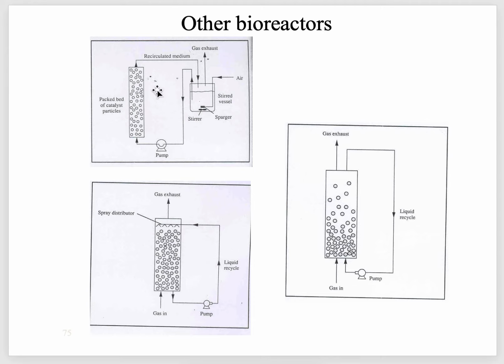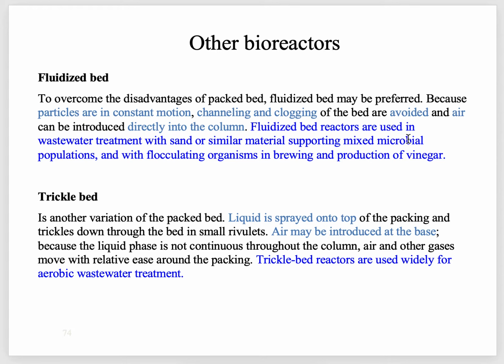Instead, in packed bed, we have to do that in another vessel. In another vessel, we do the introduction of air into the media. Then we transfer or inject that media into the column. But in case of fluidized bed bioreactor, we can directly introduce the air into the column. And fluidized bed bioreactors are used in wastewater treatment with sand or similar material supporting mixed microbial populations, and with flocculating organisms in brewing and production of vinegar.